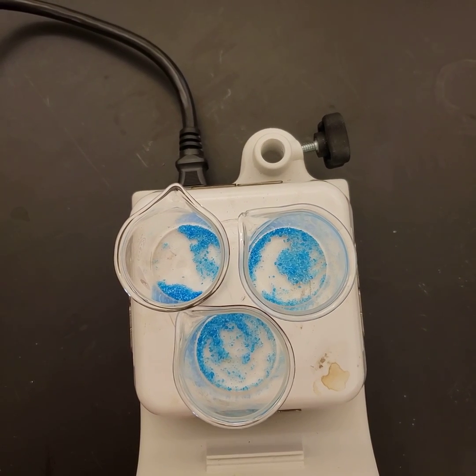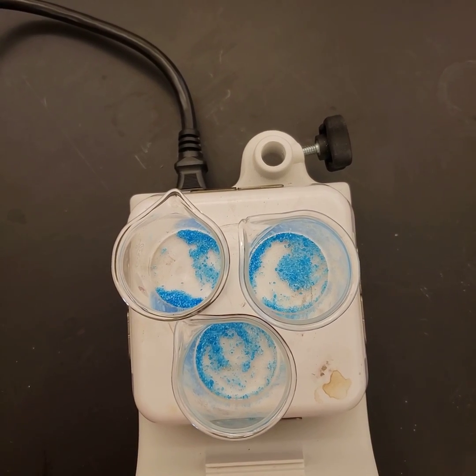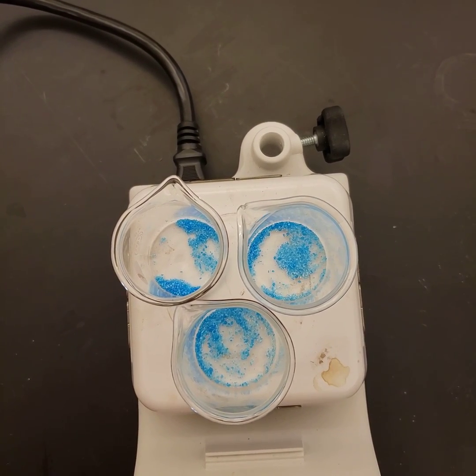We're going to heat that water off — drive that water out of the system. By the difference in mass between the original hydrated salt and the dried salt, we'll be able to tell how many moles of water were in there per mole of copper sulfate.